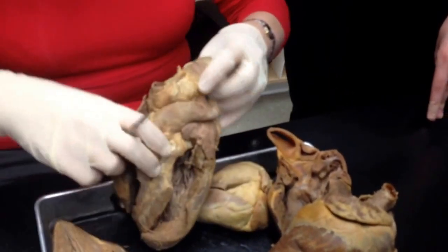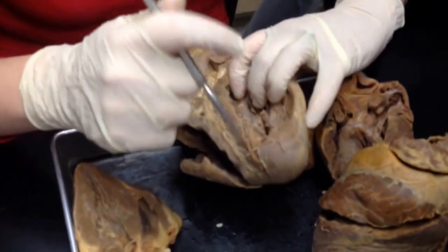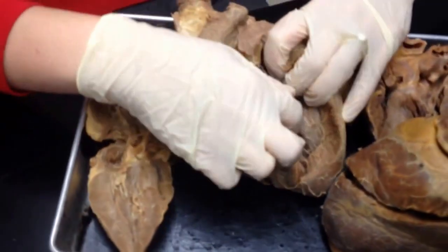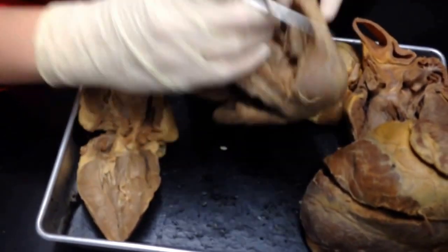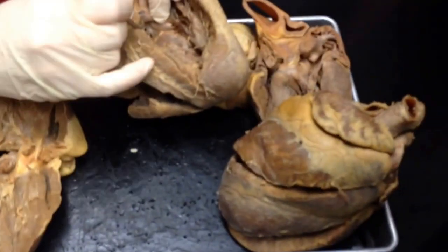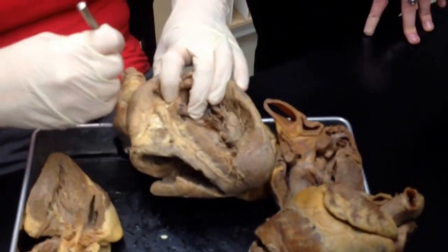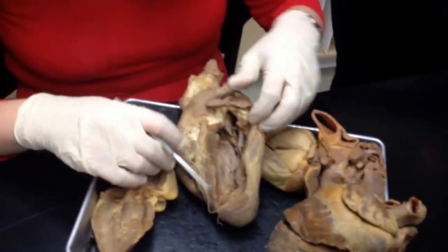Now, here's the aorta. If I pull up on this and out, this is the left ventricle, so the vessel that takes blood out of the left ventricle is the aorta, and there's my pointer, it's coming out. Therefore that means there is a semilunar valve right in here, and I'm pulling on it, so that's one of the cusps there. That's the aortic semilunar valve at the base of the aorta.